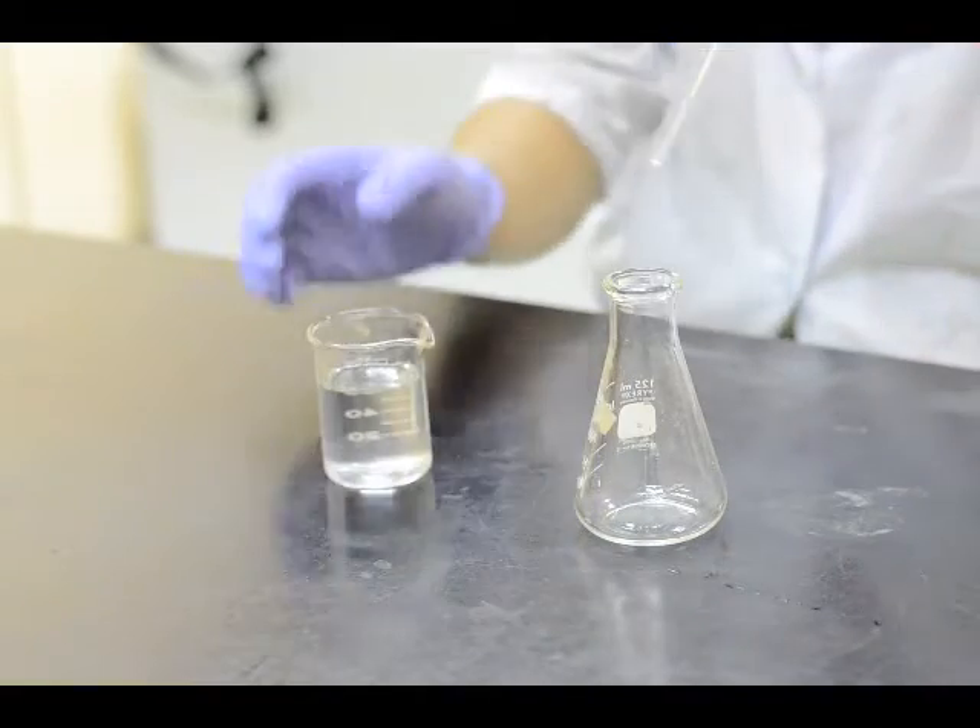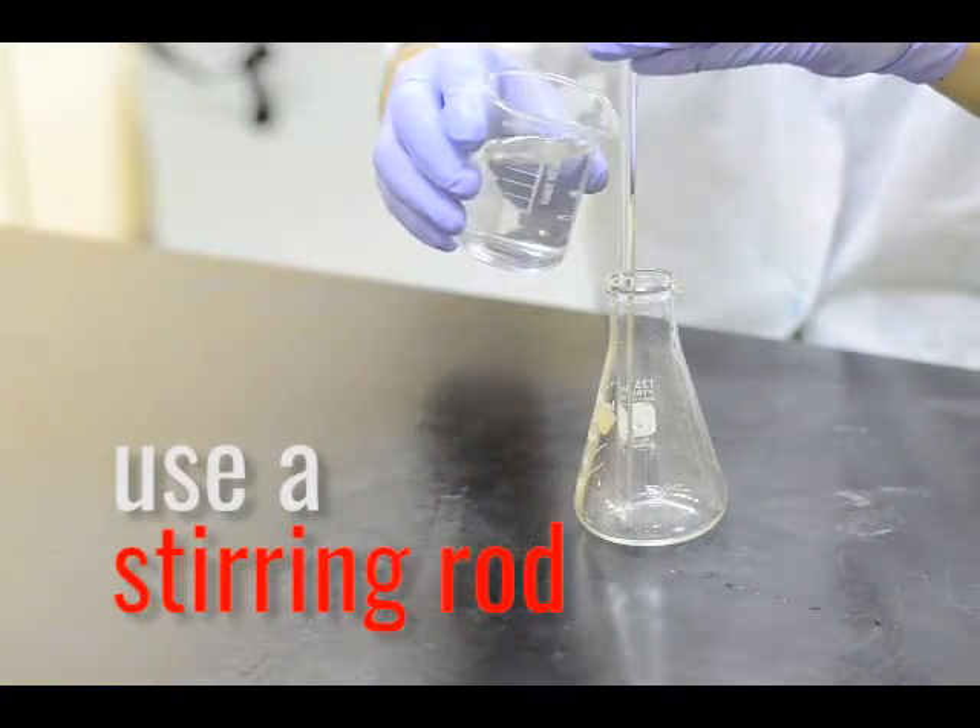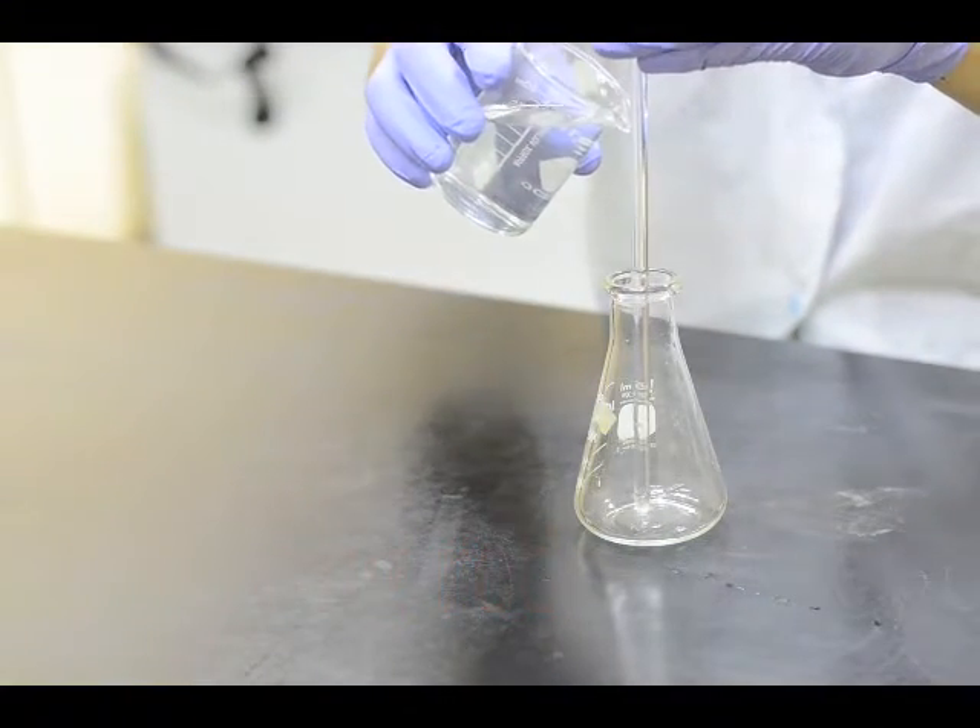When transferring liquids, he uses a stirring rod to guide the liquid to the other container without spills.